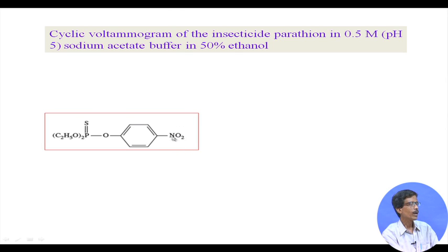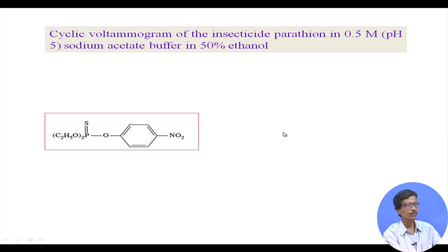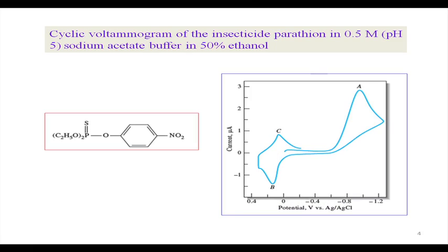So if you have the substituted nitro group on this, then which part basically, if we consider this is A part, this is B part, and this is C part. So an organic molecule in your hand having A, B, C, 3 parts together, and we want to see the electron transfer reaction in terms of cyclic voltammetry of this molecule, and want to see whether part A is electroactive, or part B is electroactive, or part C. So this is the typical response.